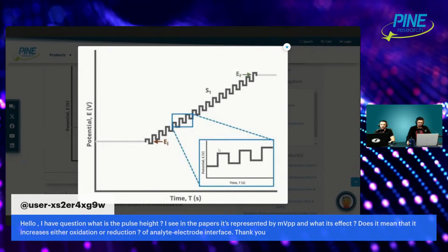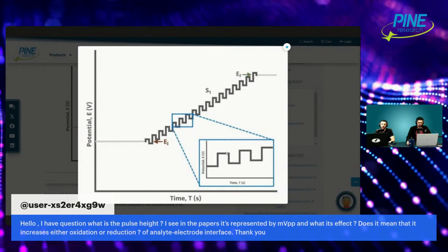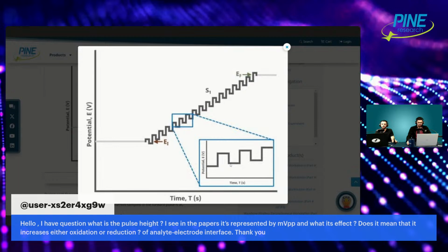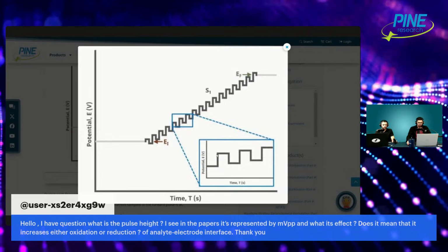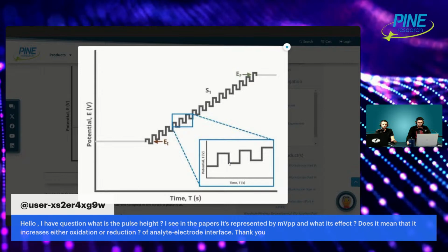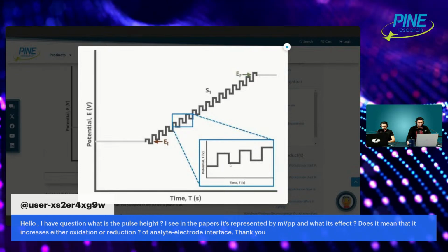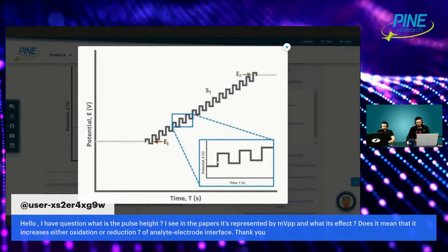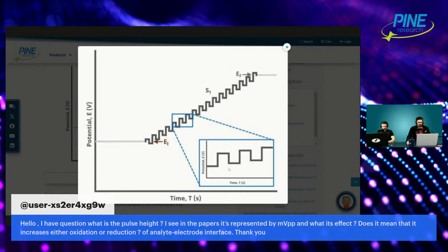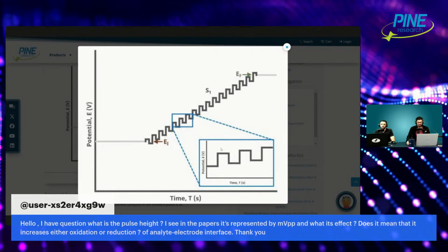I think what I mean by peak to peak is from this step, from this pulse to the next pulse, is, I believe, the peak-to-peak millivolt change. There's this pulse height. It's being held for a period, and usually this period and this period, when it's stepped down, are the same. But then it increases by a very small increment. So peak to peak usually is referring to one of these two things, and I believe it's referring to this small change. It goes up, it makes a small change when it's pulsing, and that's what I believe is meant.